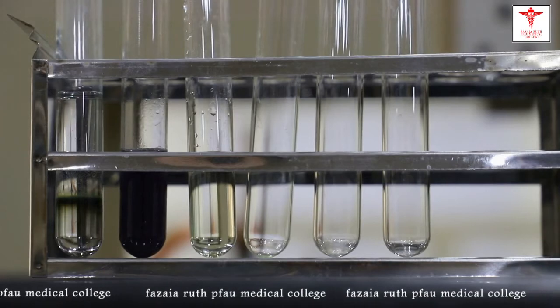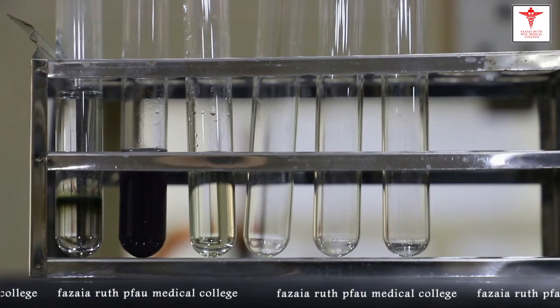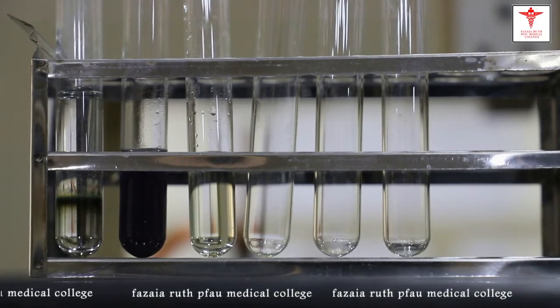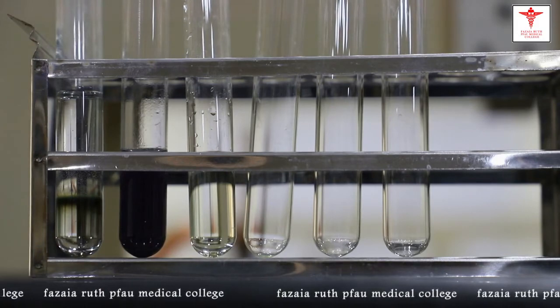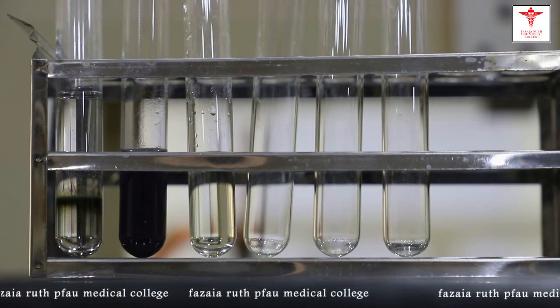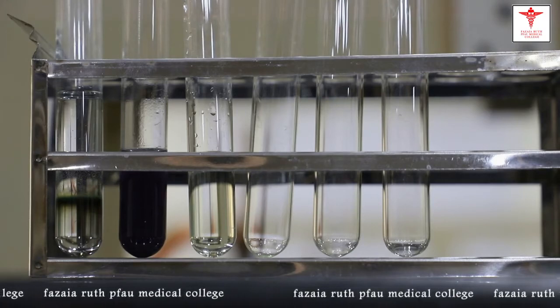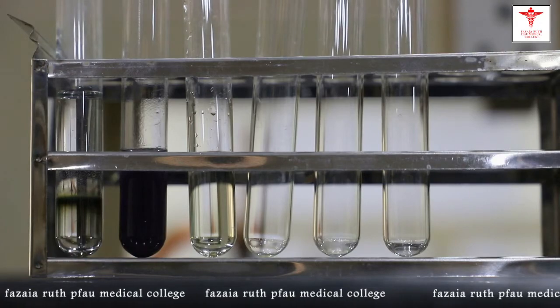Now we'll perform the third test, that is Benedict's test. The purpose of performing Benedict test is to differentiate between reducing and non-reducing sugars. The reducing sugars will give a positive Benedict test, while non-reducing sugars will give a negative Benedict test.